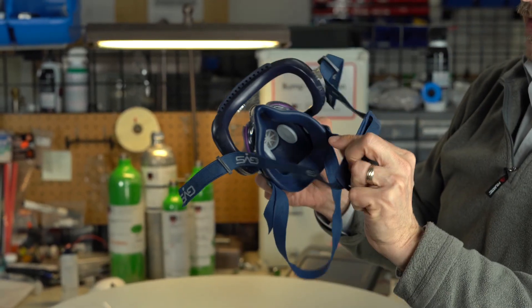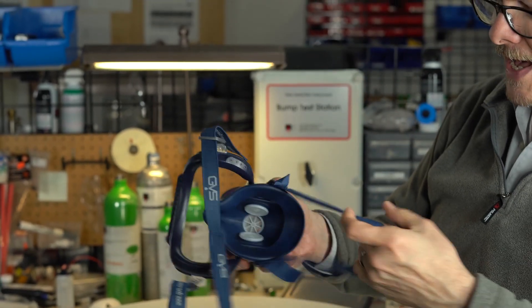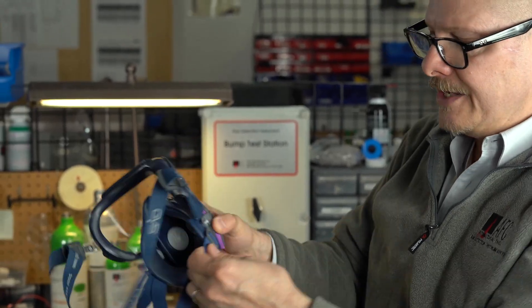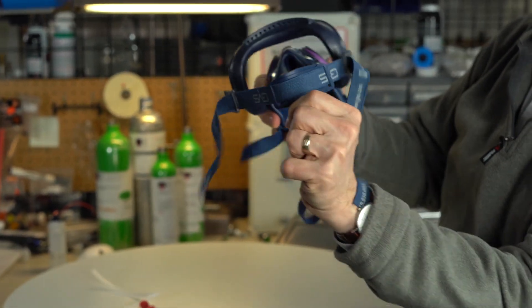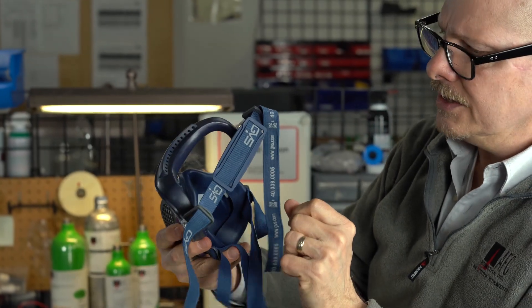You've got a top head strap — a really nice head strap for the top. And then on the bottom, you've got a nice wide strong strap on the back around your neck. To tighten those, you're just going to pull straight back and that goes ahead and tightens it to the back of your head and to your face to make a nice sealing edge.